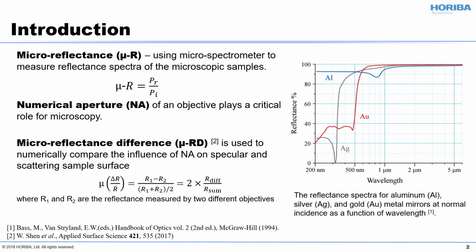So reflectance is defined as the fraction of power in the incident wave that is reflected. In this case, besides the reflection spectrum from the sample, we also need the spectrum from the reference, which can be the reflection signal from a mirror, for instance. The appropriate mirror is capable of reflecting incident light almost completely, since our test is in the visible range. So we chose the aluminum mirror according to this chart.